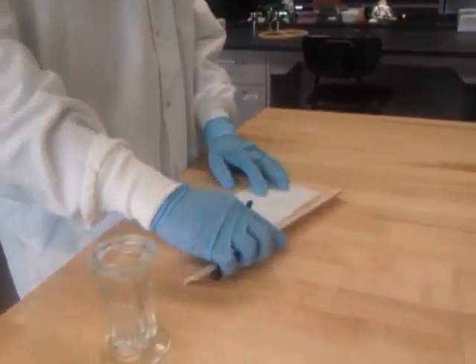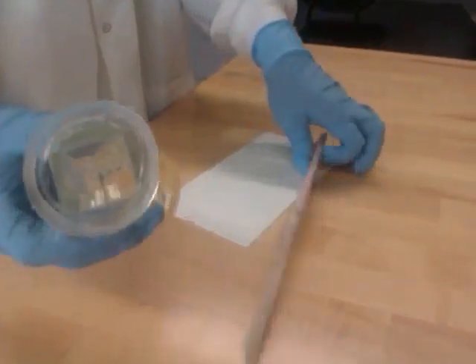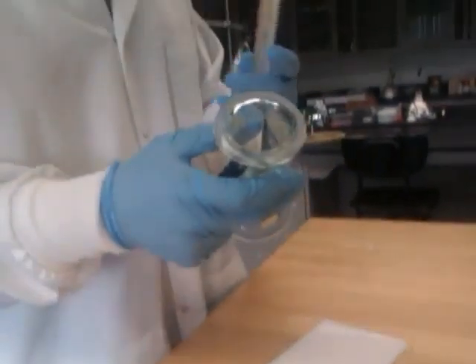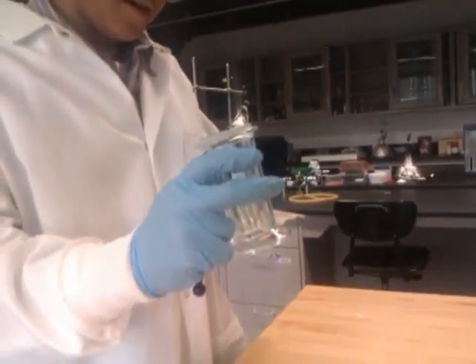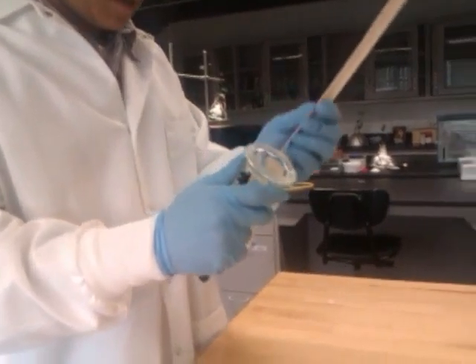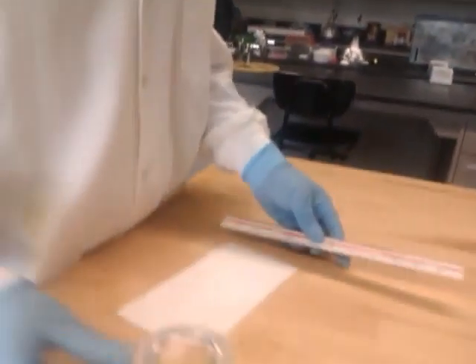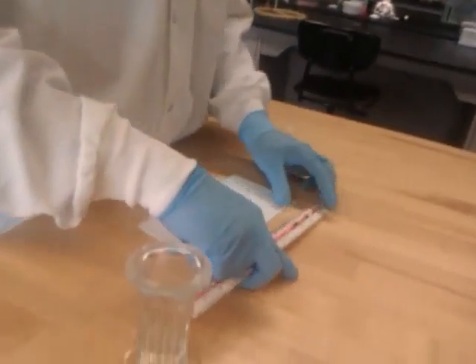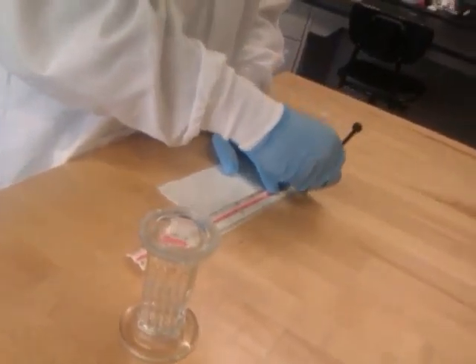So when you're cutting TLC plates, first set a defined marker. Measure your TLC chamber to see how wide and how long you need your TLC plate. For this one it's about an inch by an inch and a half to two inches. So what I'll do is get my inch and then mark it.